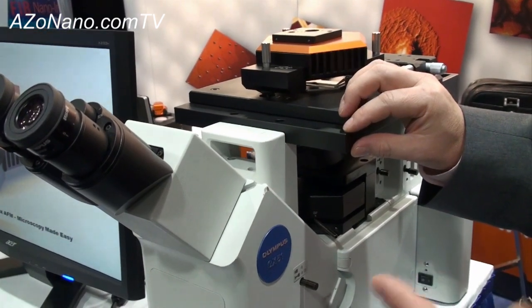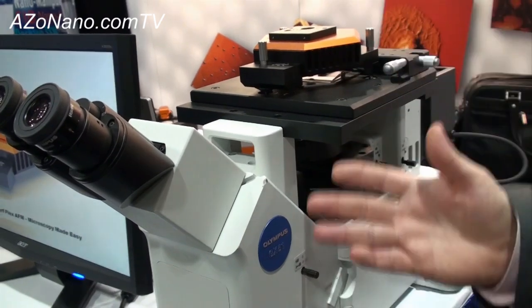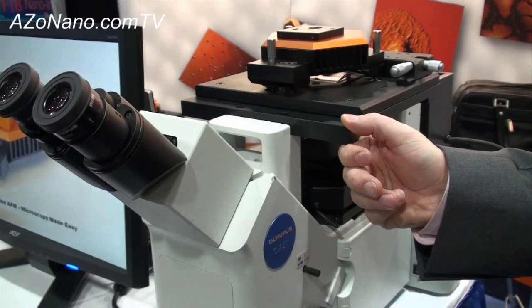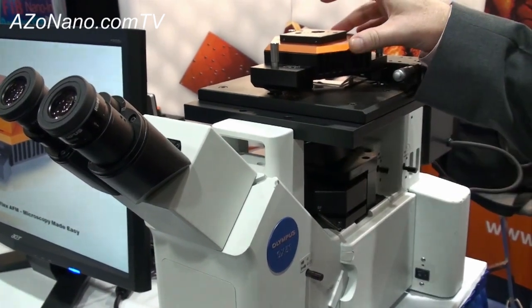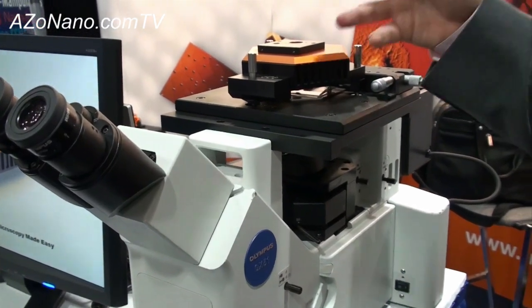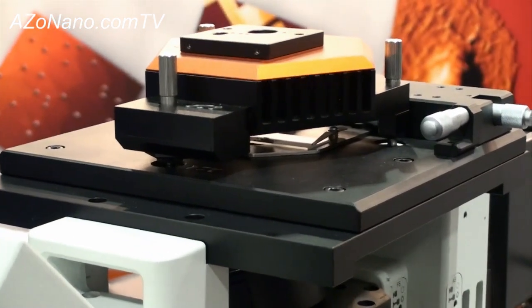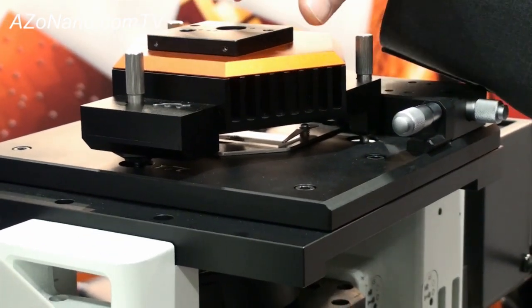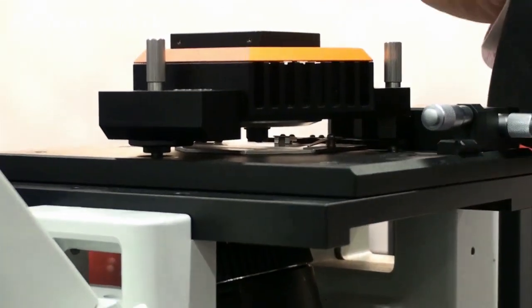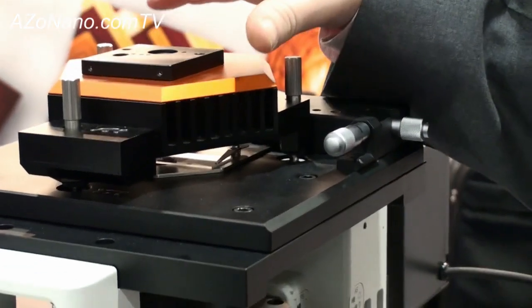Many people that might want to use the Flex for bio types of applications are interested in using AFM in combination with an inverted optical microscope. We have a new base plate option where the AFM can be integrated with inverted optical microscopes so that you may utilize other optical techniques in conjunction with AFM. You can do fluorescence, phase DIC types of applications, and also utilize the AFM with the ability to scan in liquid or in air. That's a nice comprehensive setup for the life science applications that the Flex can easily handle.